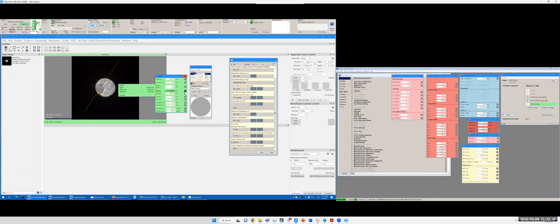You can see the change in the Ronchigram when I change astigmatism, right? Do you see that? Okay, good. I can tune it to be zero for all those values, and then I type in a defocus of -500. Okay, I only see a few gold particles. Okay, so that is good.